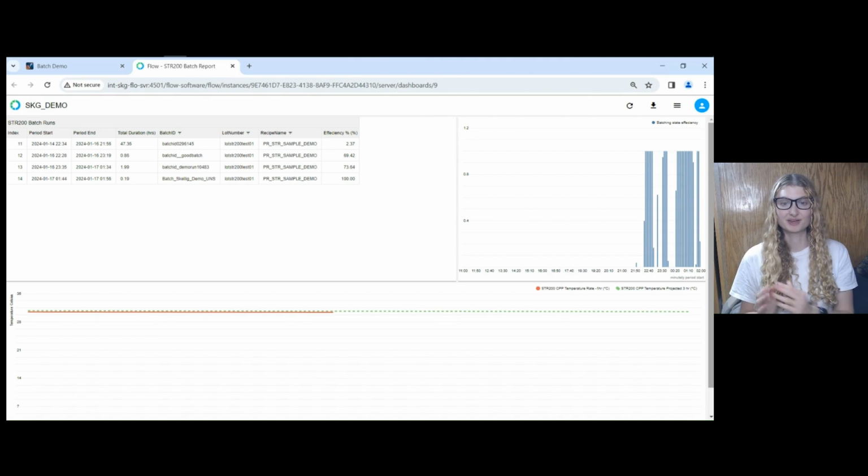This is awesome. Normally, your 3.0 plant forces your operators to always be reactive. Only when something hits the alarm do they get the notification to take action. And in life sciences, that's a huge problem. We can't just run out there to see what's going on.